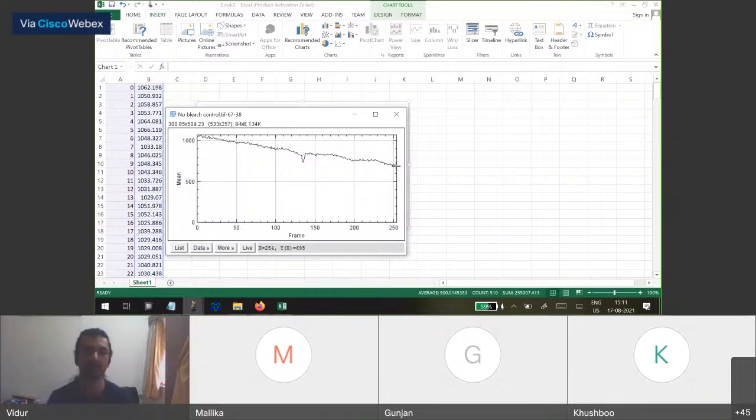You can quickly do it maybe on the microscope itself when you're assessing the laser power, the exposure time and all that. And you settle on a laser power, exposure time, pixel density such that the photo bleaching is not greater than 50%.